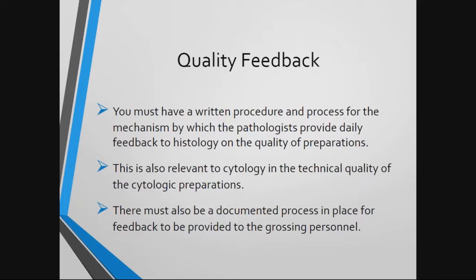For the cytology prep area, we have a more manual method of documentation where we reflect our assessment on a staining QC sheet and on the Cytotech daily screening log. For histology, however, we do use the LIS to document our quality feedback. And believe it or not, our pathologists do actually document their quality feedback in the LIS. We print reports then on a regular basis so that we can assess that quality feedback.